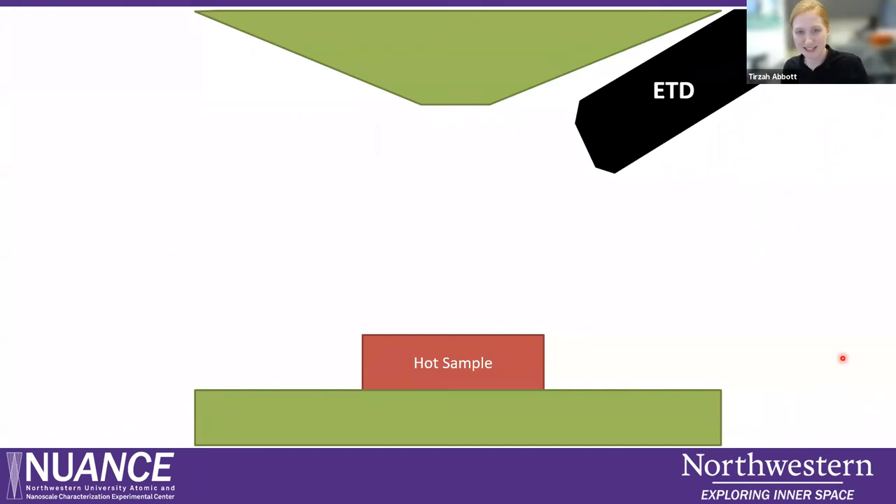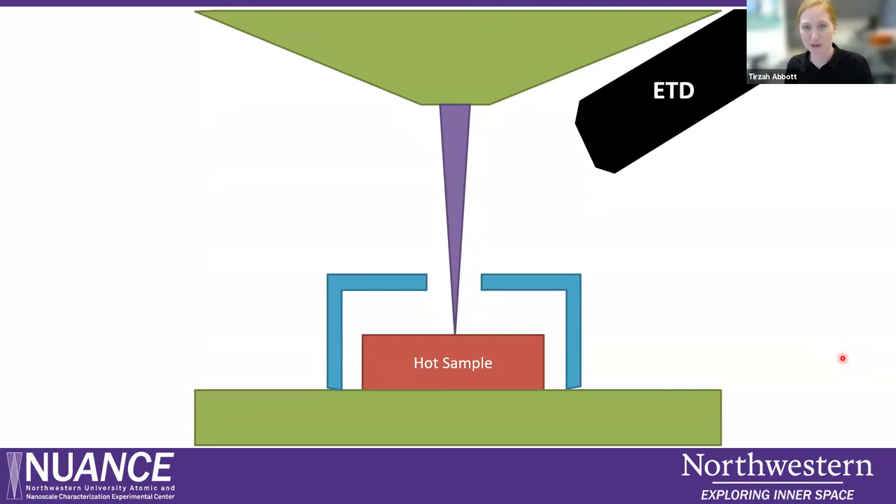Heating in the SEM can be a little bit challenging. When you heat up the sample, you will create secondary electrons and you can use the Everhart-Thornley detector just like normal imaging. But there's another source of imaging artifacts: thermionically emitted electrons from the heating of the sample, which can wash out your image and make it really hard to get a good picture. The Gatan Murano heating stage comes with a heating shield, which is multipurpose — it protects the internal components of the SEM from the high temperature, and it can also have an applied bias on it to attract those really low energy thermionically emitted electrons, so you can reduce artifacts in your image.